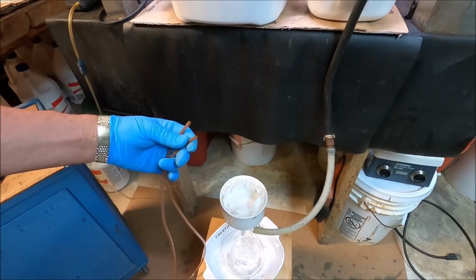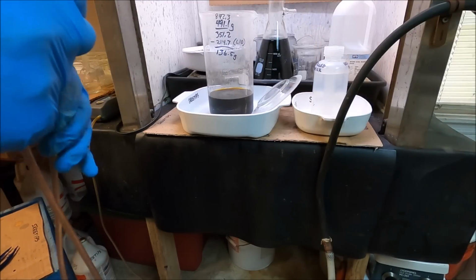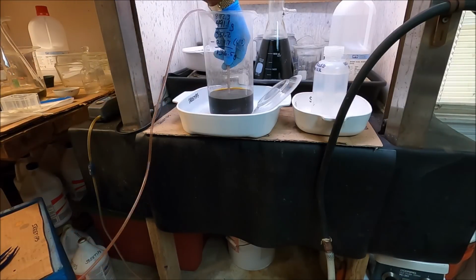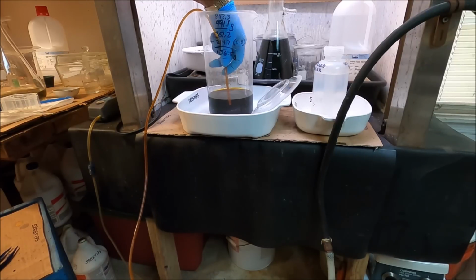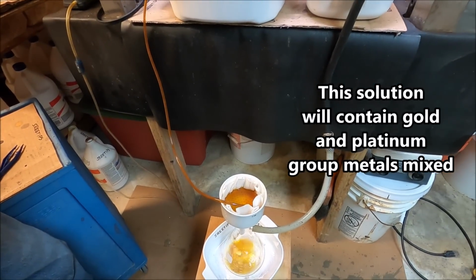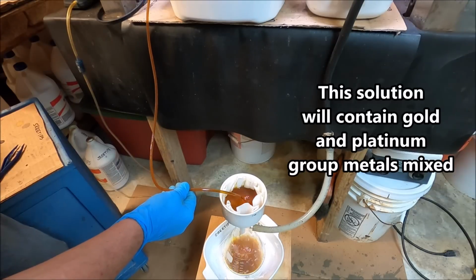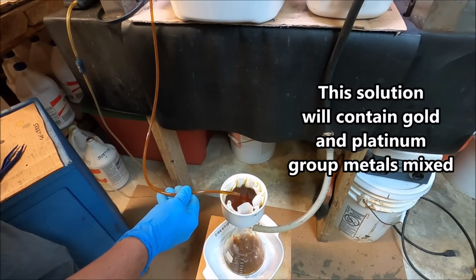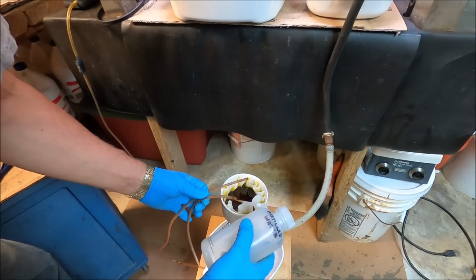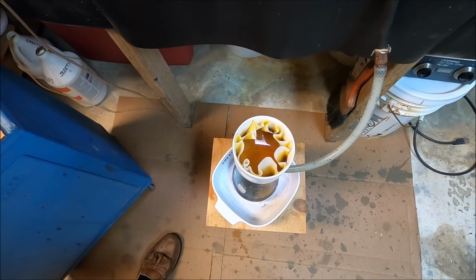Alright, now here we go. We're going to stick the tube in our beaker up here. I'm going to draw all this solution out of this beaker. I got some water in there, yep. Draw the solution out of this beaker down into our funnel down here, and through this filter here.